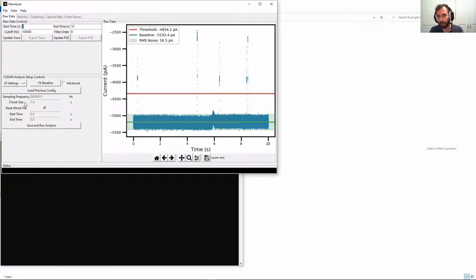Now, this is going to be a fairly long video because there are a lot of parameters to set up. Not to worry, you only have to do this initial setup once. Most of these parameters are specific to the hardware and acquisition settings that you're using. Assuming those don't change significantly between each experiment, you'll only actually have to set most of these parameters once. And the next time you do this, it's going to be much simpler. There will only be a handful of numbers that need to be tweaked. But for now, we're going to go through all of these one at a time.